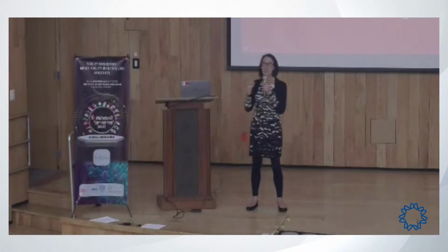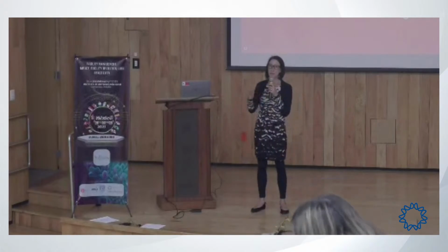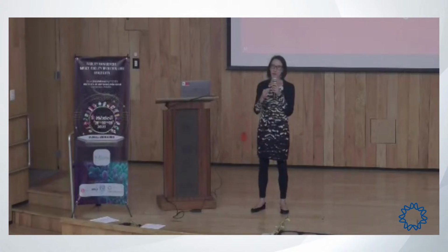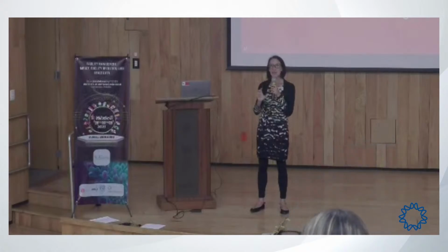Yeah, so right now with all the hardware we have, that's a very good question, because at the beginning you needed to collect millions of particles to have an accurate, high resolution 3D reconstruction. Right now, because we have very good cameras, and software with artificial intelligence and different algorithms, that can help you collect only in the very good areas of the grid. So you don't need millions of particles right now to get very high resolution of your protein.